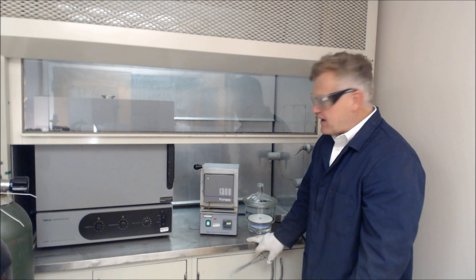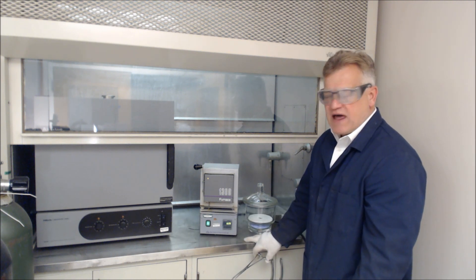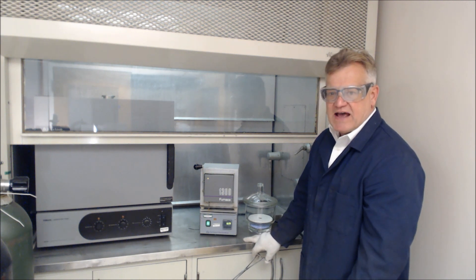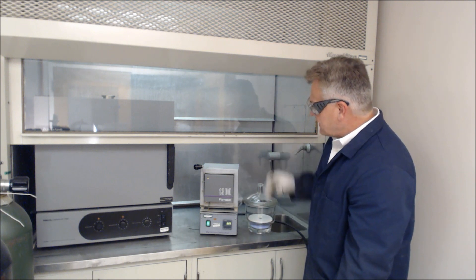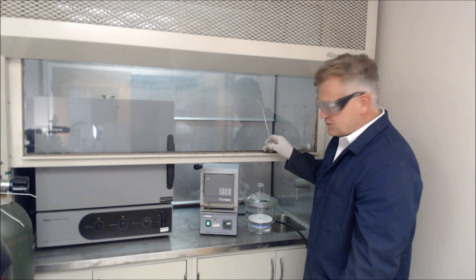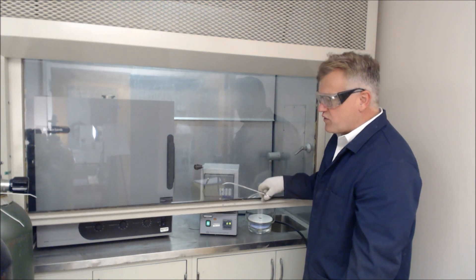From a safety perspective, you do have to worry about wax buildup because this is flammable. You certainly want to limit the hazard of a fire. Here you see the smoke coming off and going up the fume hood with the filters involved. You do have to wait for three minutes for the burn.